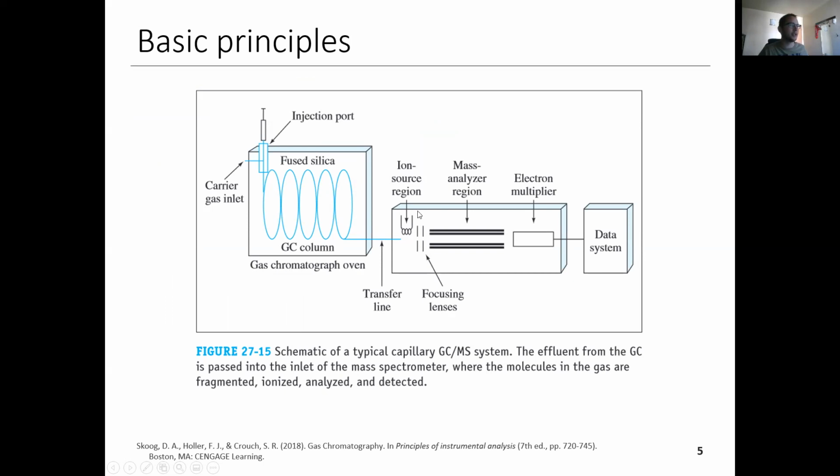This is focused using some electromagnetic fields passed into this quadrupole, which is just a schematic here. So it's a magnet with 4 different poles. And then by alternating the frequency of this quadrupole, you're able to separate the ions by mass. And then you pass them over to this electron multiplier, which then reads a current, basically. So that's how this whole thing works.